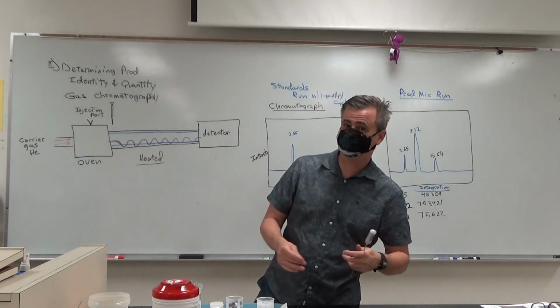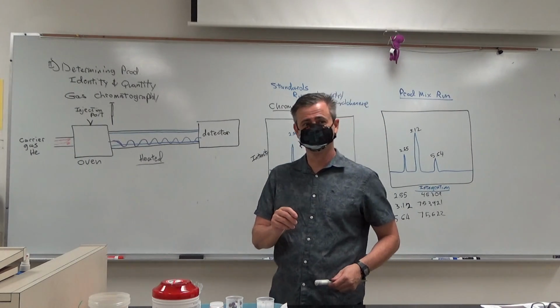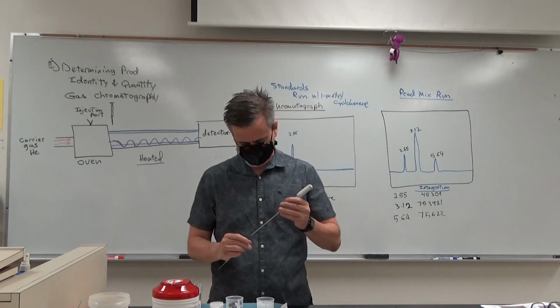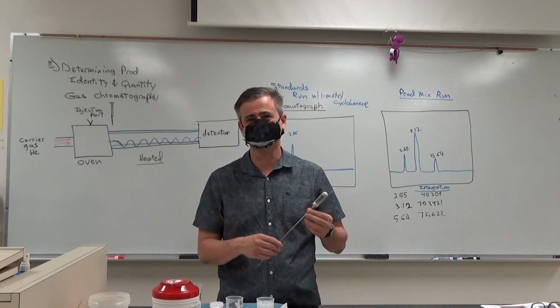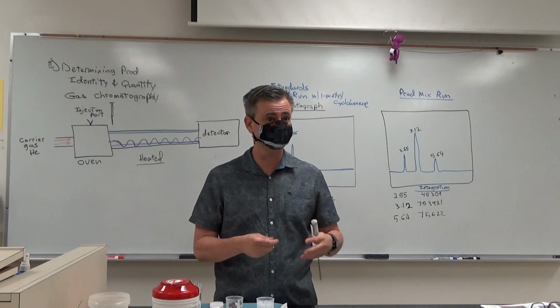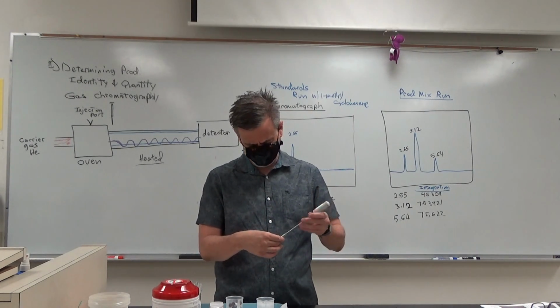It's in your brand new tennis shoes that you buy, where it says "Don't eat." We use it for TLCs, and we can use it here. What we're using it for here is mainly to capture any acid that might have made its way into your product mixture. You had a very acidic mixture there, phosphoric and sulfuric.